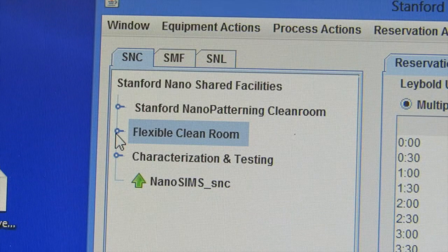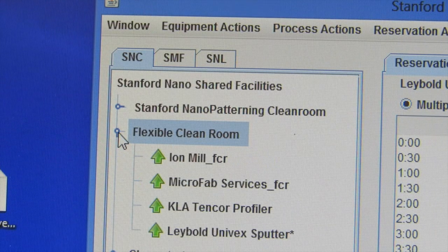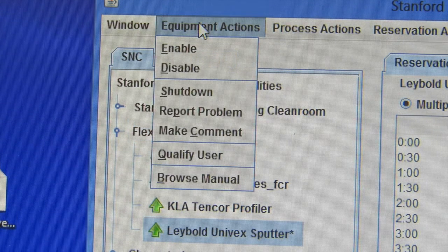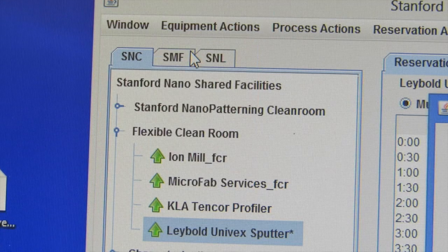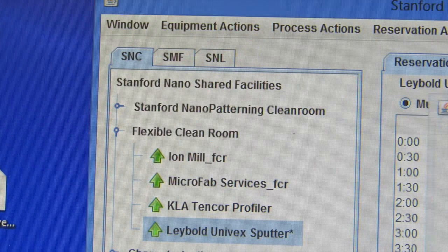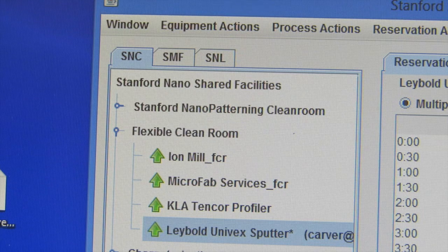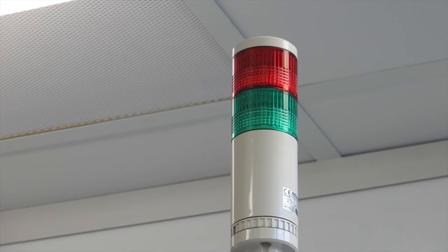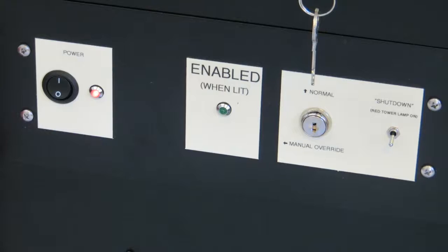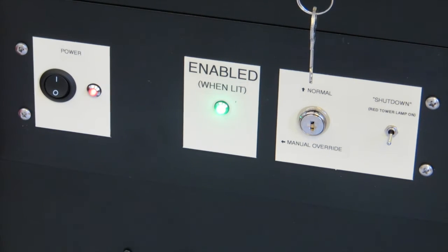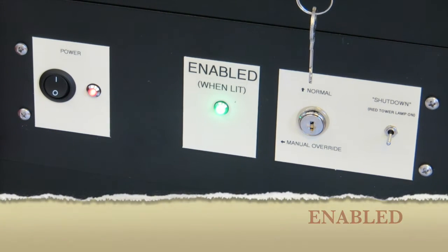Before you can open the chamber you need to go on Badger, go to the flexible clean room, click on Leybold Univex sputter, on equipment actions, hit enable and say OK. Once it's enabled the tower light will turn green. Also this panel down lower on the machine will also turn green once it's enabled.